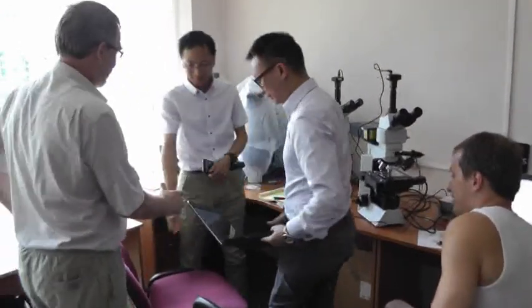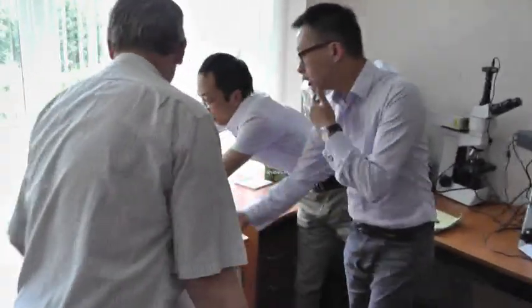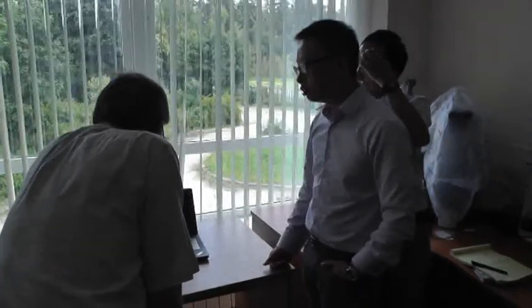Hello, Alexander. My question was initially about what I should check if we run into a microscope, to make sure it is fit for the Raman spectrometer.